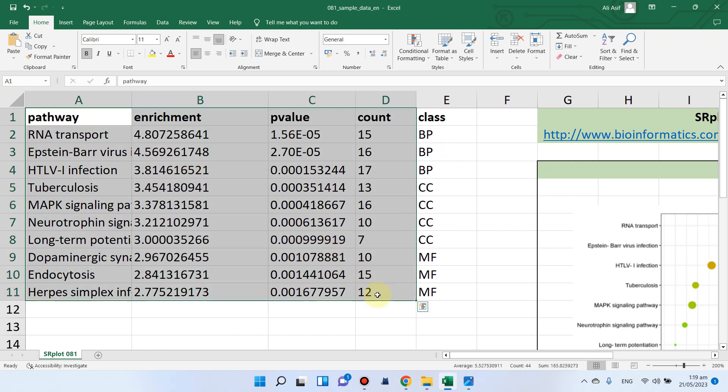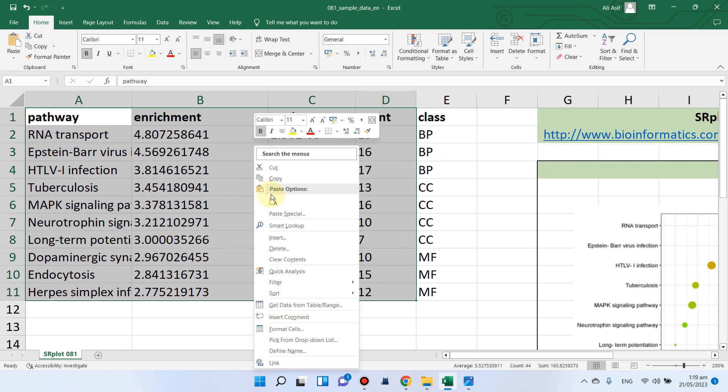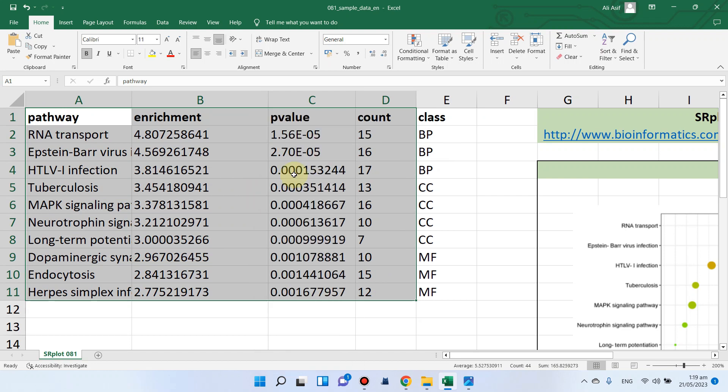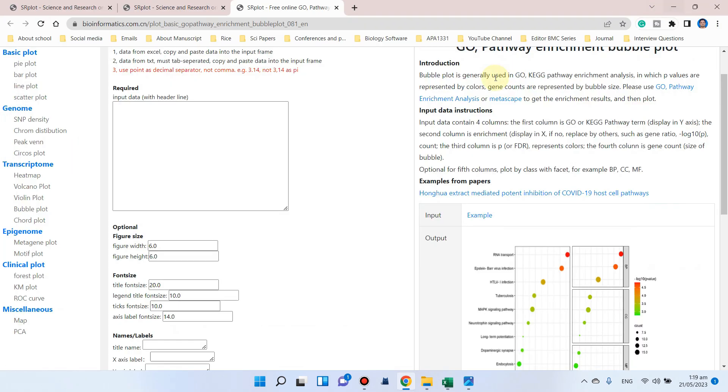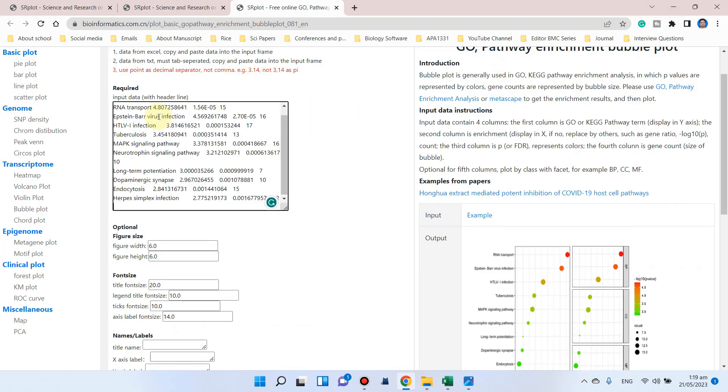We can simply copy all these values: pathway, enrichment factor, p-value, and count. We can go back and paste it into this box. We should make sure there is no space between any character.